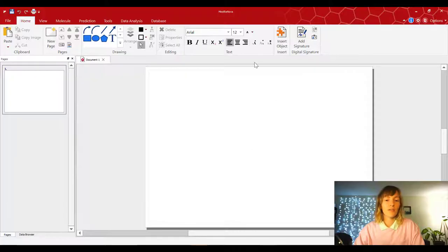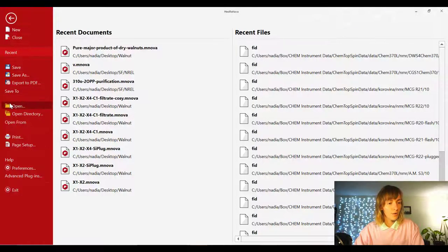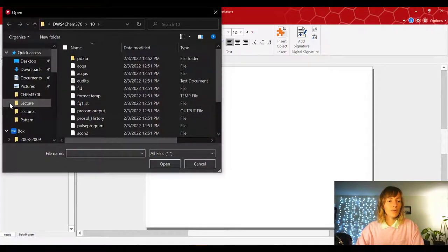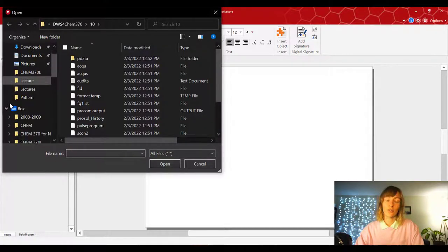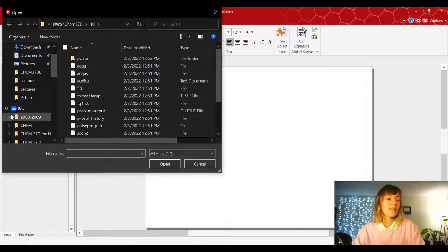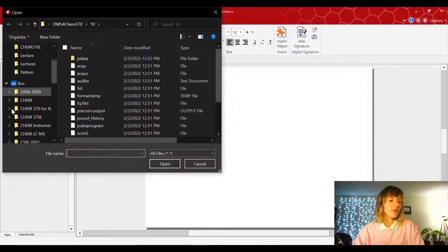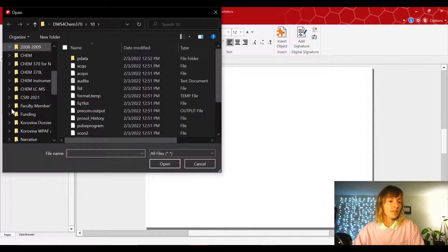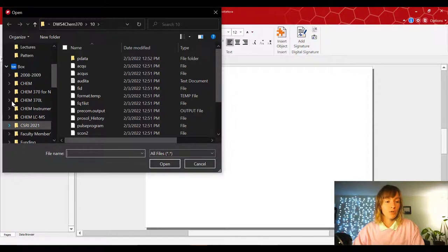So now that your MNOVA is opened up, you're gonna go to File, Open. And if you already have installed the Box drive, or if you've already installed the Box app on your desktop, then the Box file structure is going to be integrated into your file structure on the computer.